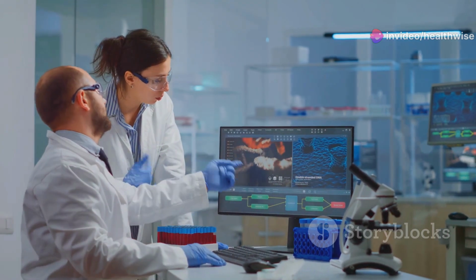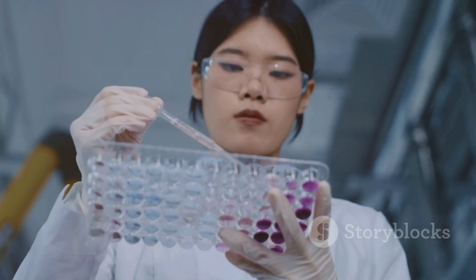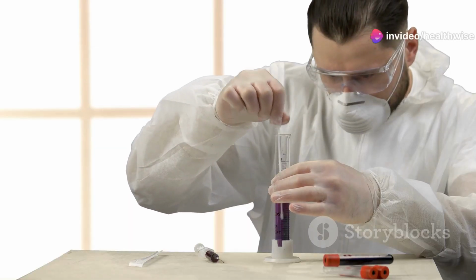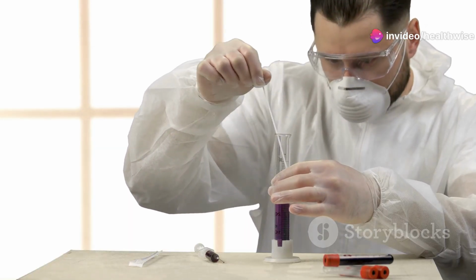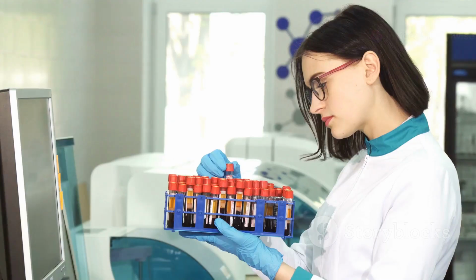Simple, right? But what if the count is expected to be high? In that case, you'll need to dilute the CSF. The diluting fluid is made by dissolving 200 milligrams of crystal violet in 100 milliliters of 10% acetic acid. The counting method is the same as for peripheral blood.